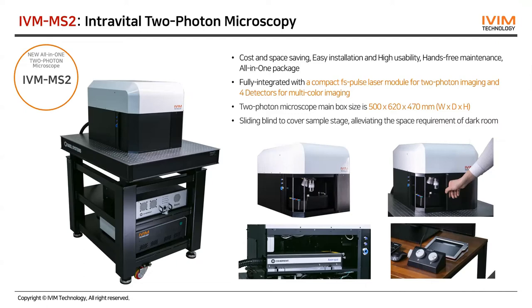But in the case of confocal detectors, the standard model is 4, but we can increase it up to 6 if it's necessary.